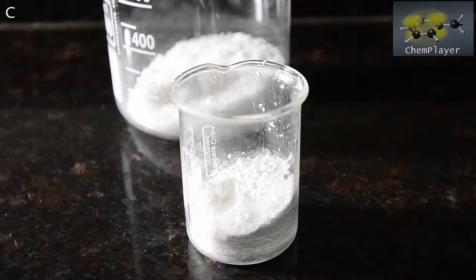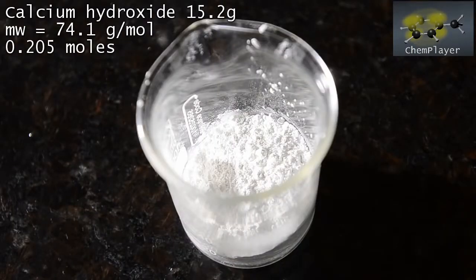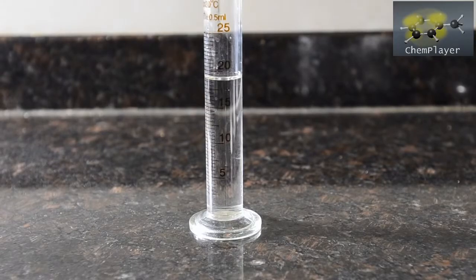So here's a 15.2 gram portion of calcium hydroxide, which is enough to convert all the benzoic acid into calcium benzoate. Water will also be generated as a side product of the neutralization reaction, but we'll hopefully be able to distill this off first. Now for our second carboxylic acid.